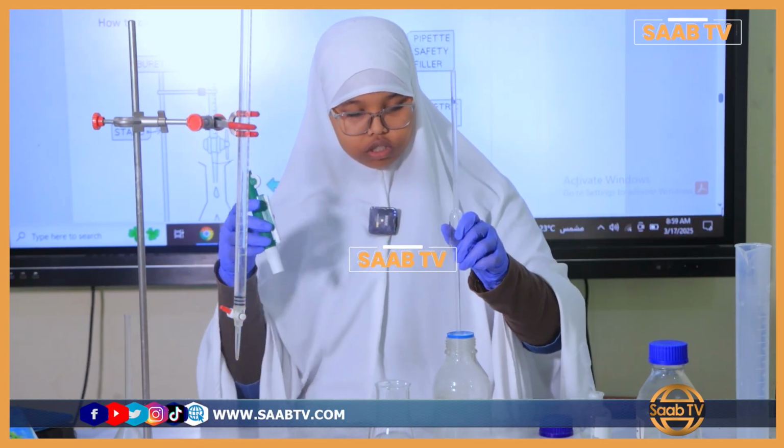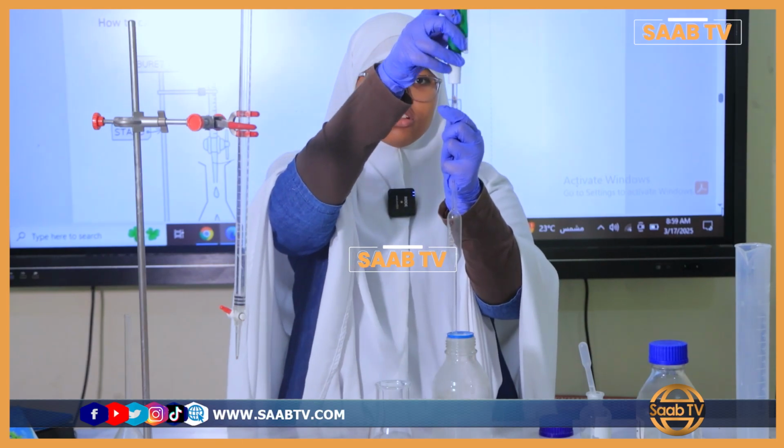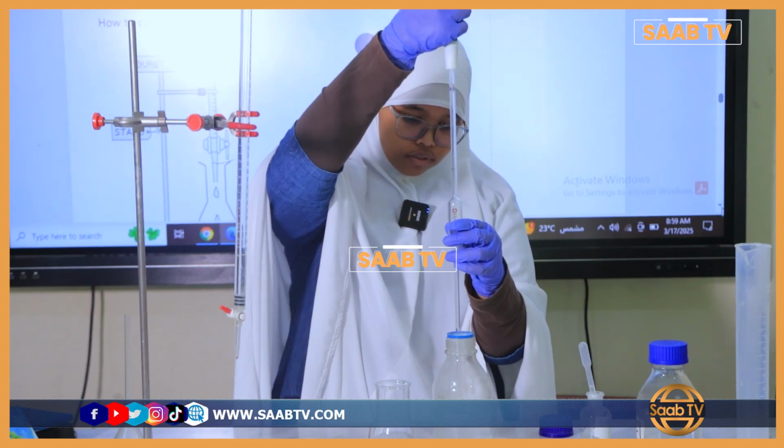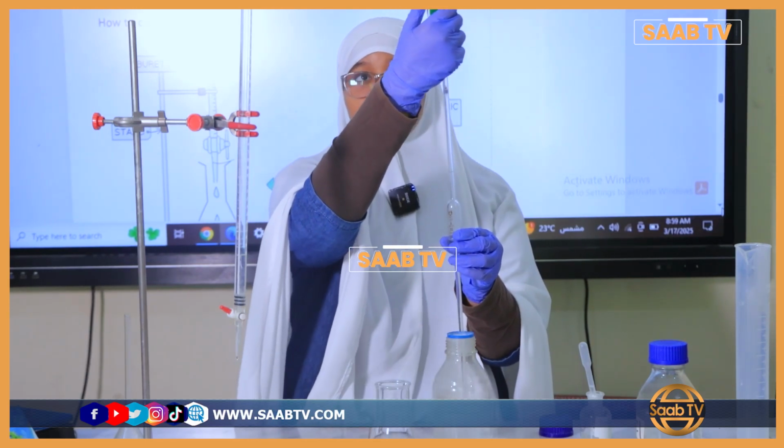So what's called the instrument? Right here we have a pipette, and we also have a pipette filler. To use a pipette filler, you do this to suck in the amount of alkali, and you hold this so it doesn't go back up.